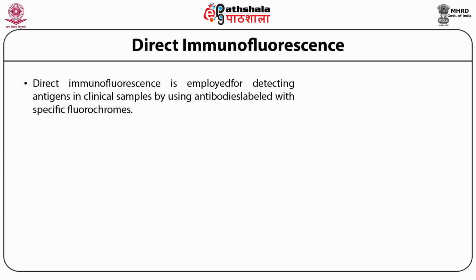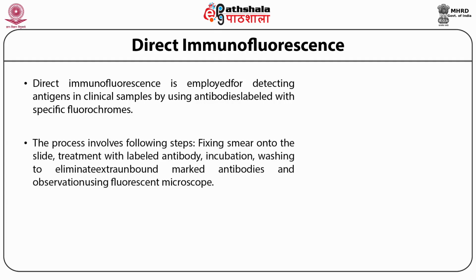Direct immunofluorescence is employed for detecting antigens in clinical samples by using antibodies which are labeled with specific fluorochromes. The process involves the following steps. Firstly, fixing the smear onto the slide.